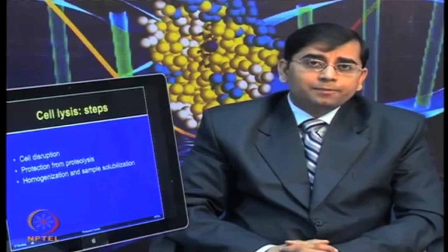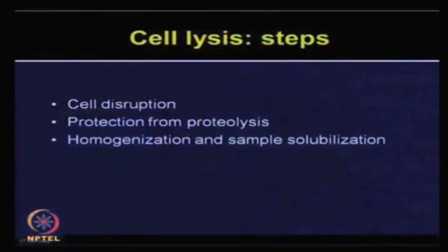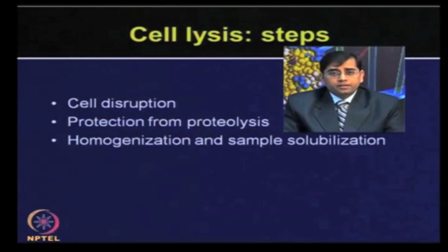The different steps involved in cell lysis: you need to disrupt the cell, protect from proteolysis during the lysis step, and homogenize and solubilize your sample.